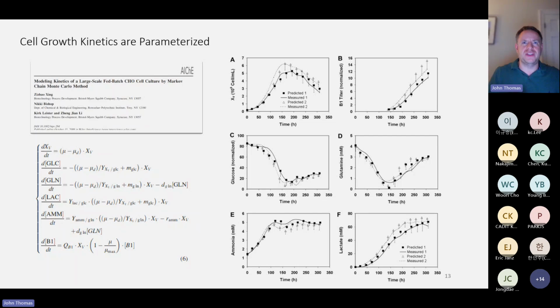They're products of the cell growth process. Lactate and ammonia are byproducts, I should say, and they have a deleterious effect on cell growth. Said again, as lactate and ammonia levels go up, that increases the cell death rate. And so foundationally, we want to keep an eye on lactate and ammonia growth and see how we can trade those off in a way that maximizes cell density and titer growth.